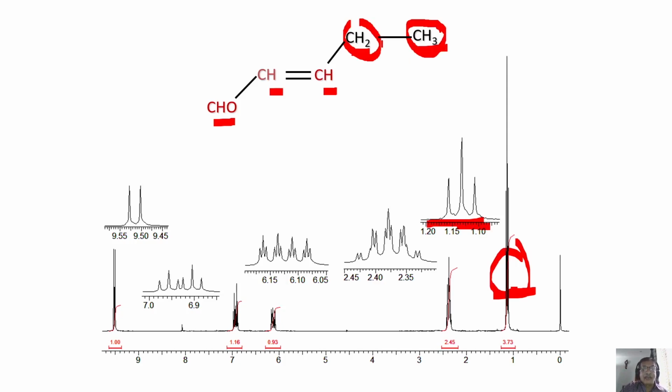And each line of the quartet has to be a doublet. Where can you get that? See, this is a quartet of, this is 4 quartets, 4 triplets are there. This is a different question. Whereas look at this pattern, this is a little bit complex pattern. I safely say initially, before confirming, let me say, this must be the CH2 because it experiences a quartet and each line of the quartet is a doublet and some lines overlap, and as you see, you can see doublets at the far end of the spectrum on either side, far end of this group.